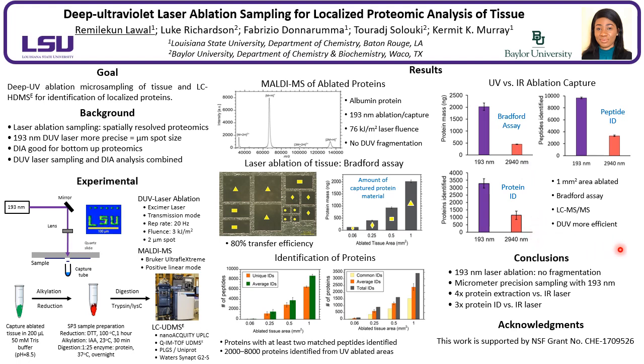To conclude, we found that the 193 nanometer laser is able to ablate biomolecules without fragmentation, and it was 4 times more efficient at extracting tissue proteins compared to the previously used infrared laser.